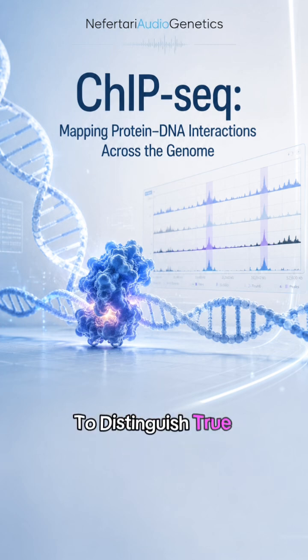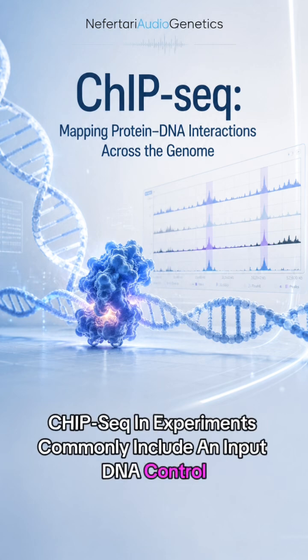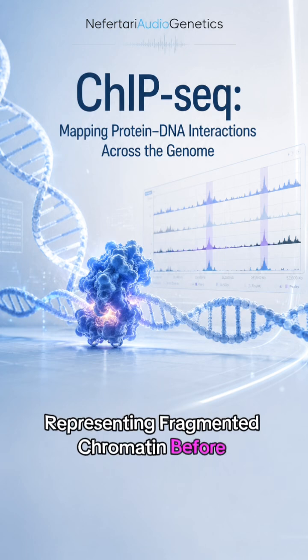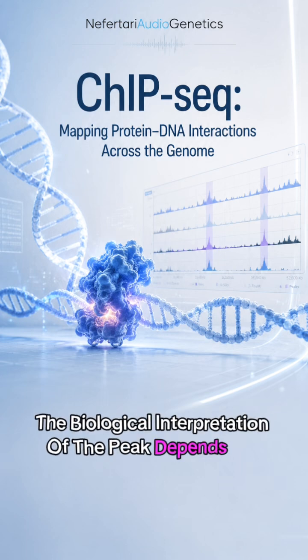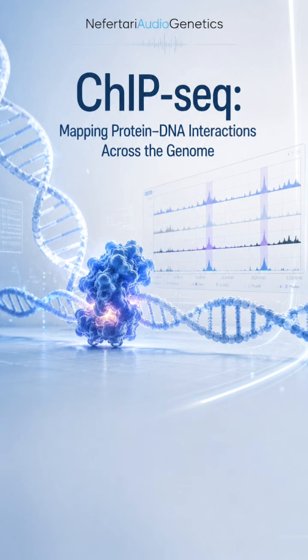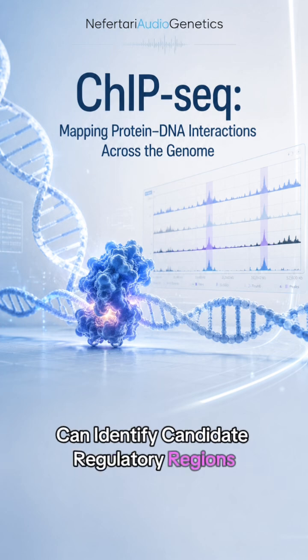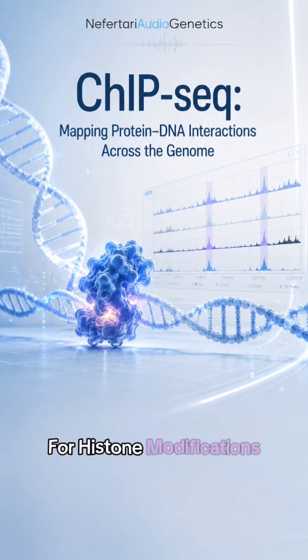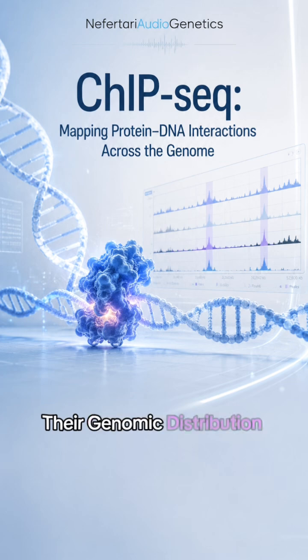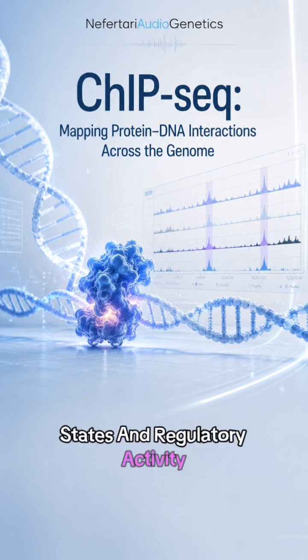To distinguish true enrichment from background signal, ChIP-seq experiments commonly include an input DNA control, representing fragmented chromatin before immunoprecipitation. The biological interpretation of the peak depends on what is being studied. For transcription factors, peaks can identify candidate regulatory regions including promoters, enhancers, and regulatory elements. For histone modifications, their genomic distribution can provide information about chromatin states and regulatory activity.